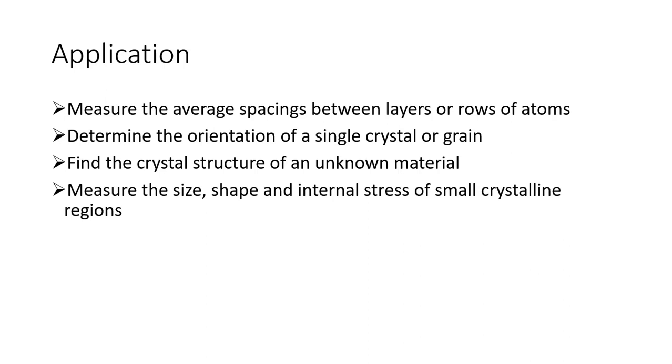Good morning, friends. Today we will discuss one technique with which we can find the crystal structure, and it is X-ray diffraction. So first of all, we will see what the applications of this X-ray diffraction are. There are lots of applications of it.